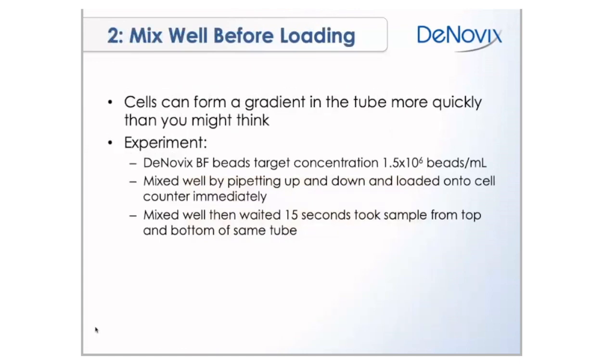Tip number 2, make sure that you mix well before loading. So I think this one is kind of obvious. Everybody knows you need to mix your cells. But I think what's maybe not so obvious to people is how quickly the cells can form a gradient in the tube. So the recommended protocol is to either vortex it right away and then measure.